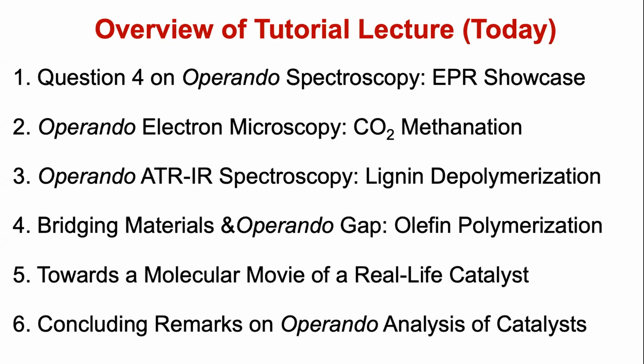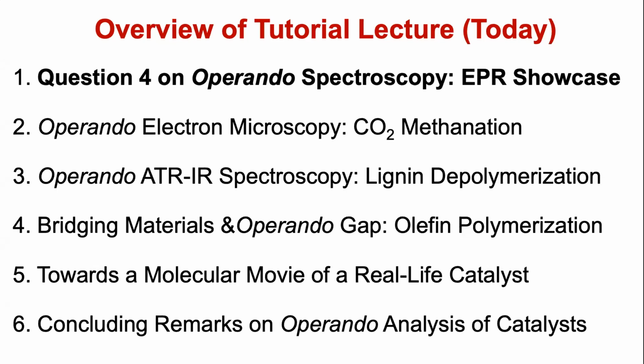I will talk about Operando electron microscopy. You will see that I discuss a lot on Operando infrared. Then I will try to show you some bridging of the materials in Operando gap, and then a molecular movie and some, what's next in Operando spectroscopy and analysis.